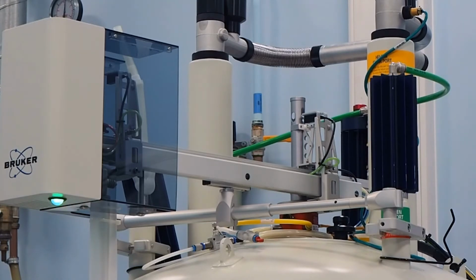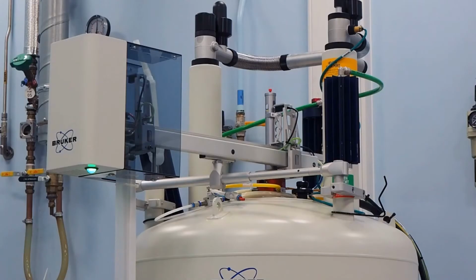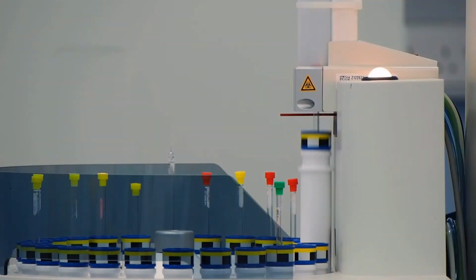The sample is then in the machine, where we're running a proton NMR, and that will take maybe 1 to 1.5 minutes to run. As you can see written on it, it's a 400 megahertz NMR machine, and we'll use that later on.